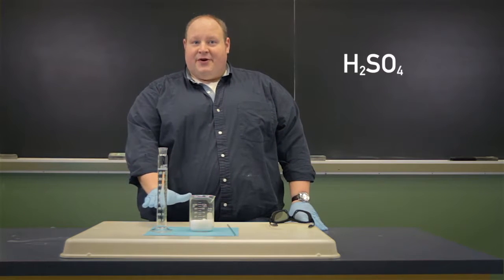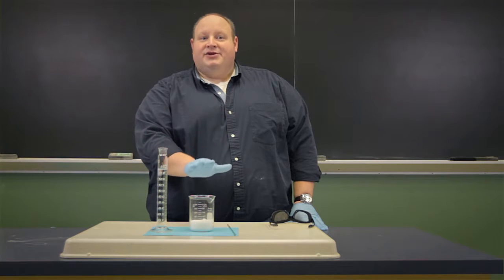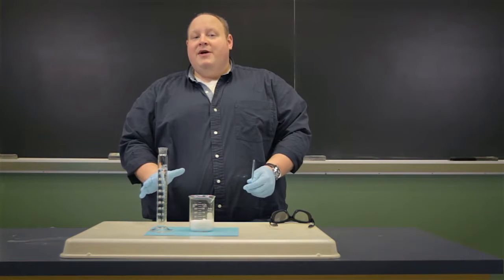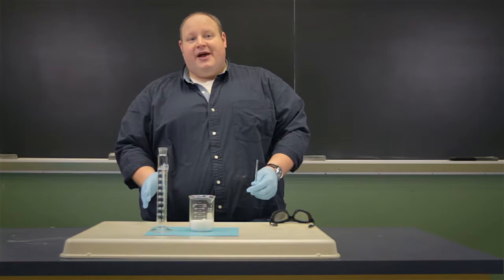I'm going to add sulfuric acid to this beaker that contains sucrose and stir the mixture with my stirring rod. What we should be looking for is a chemical change. Now, when we do a chemical reaction, what indicates that a chemical change is taking place?